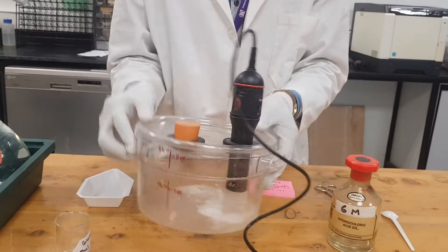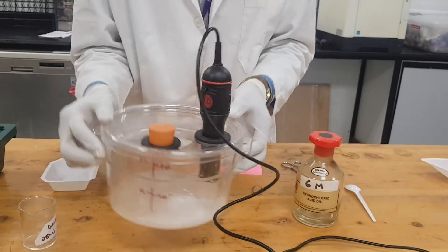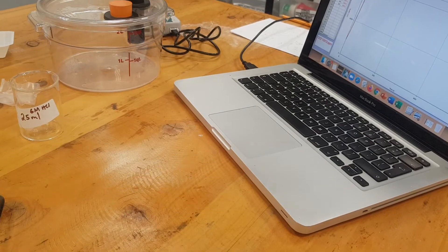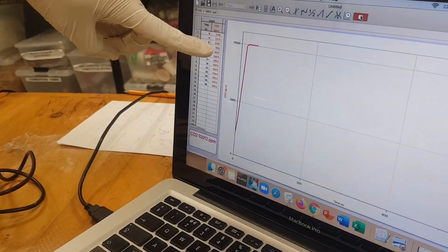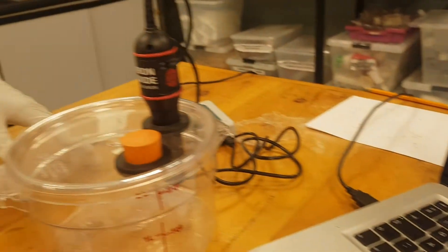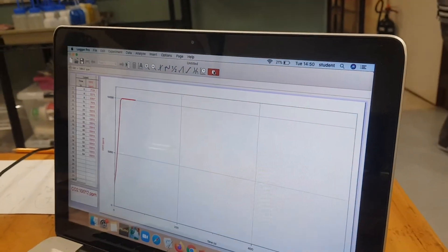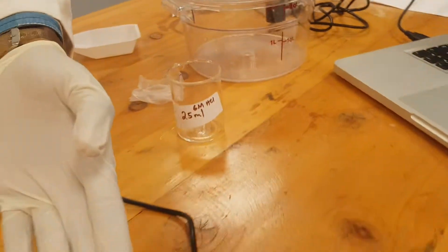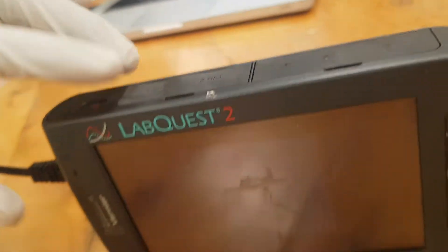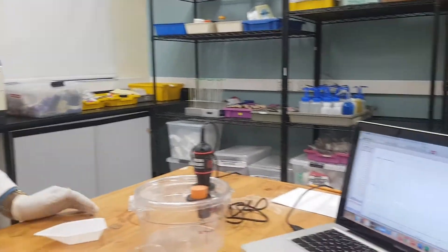You can do like this so that all the acid gets into contact with the sodium hydrogen carbonate. Don't be afraid because it's not that violent. Our graph is showing the concentration of carbon dioxide gas being produced. Once the reaction is finished, it will end and there will be no more reaction. What I want you to understand is how different volumes of acid will give you different results of carbon dioxide produced.